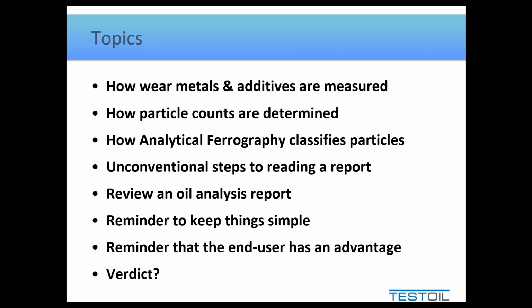And it's actually much more efficient than the way people usually dance around and look at all the highlighted numbers and try to figure out where everything's sourced from. So I'll go over those steps and then we'll actually do a real case study. So this is an actual report and we'll review it. We'll look at things, we'll follow my steps and we'll see how it goes.